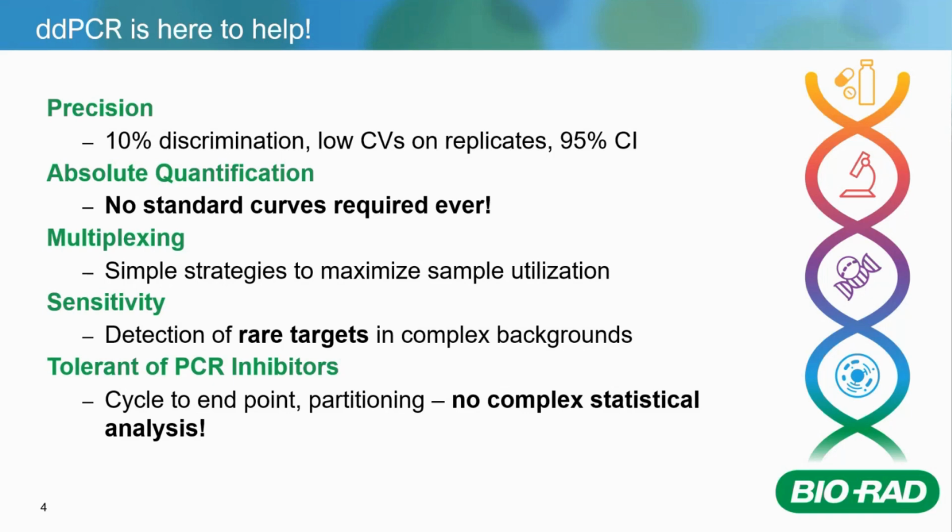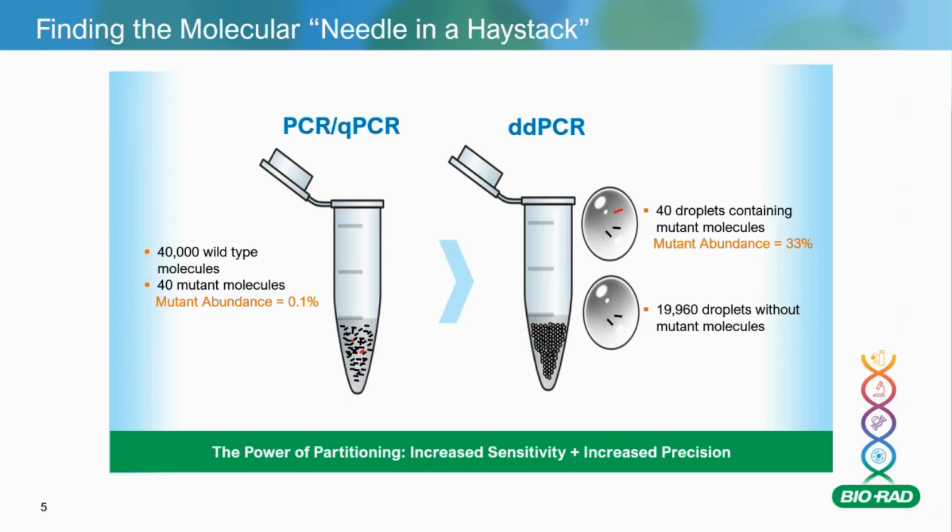And then today, another two big focus points are going to be the sensitivity, a greater sensitivity when compared to other PCR methods, and much higher, like I discussed, than things like NGS, and then inhibitor tolerance as well, and how that can increase the quality of your results.